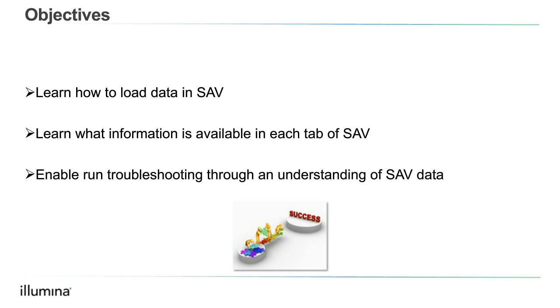Our goals for today are to learn how to load data in SAV, learn what information is available in each tab, and enable run troubleshooting through an understanding of SAV data.